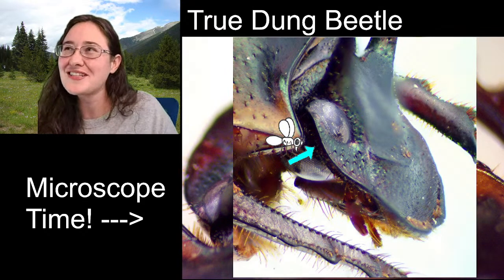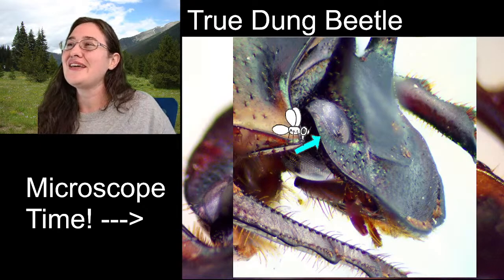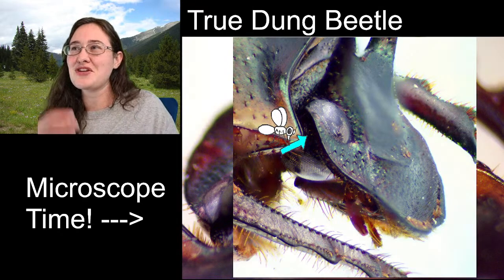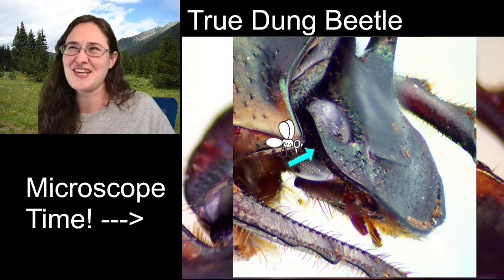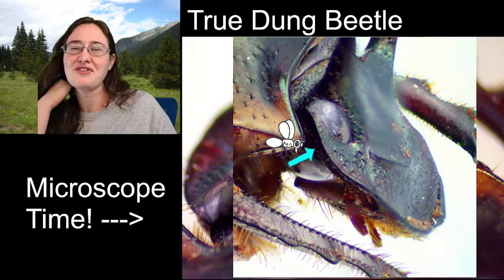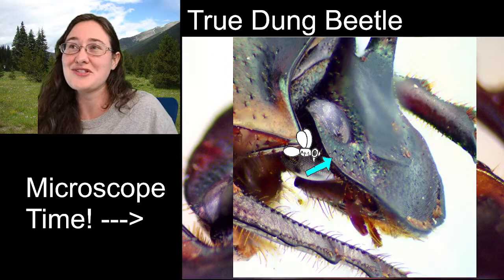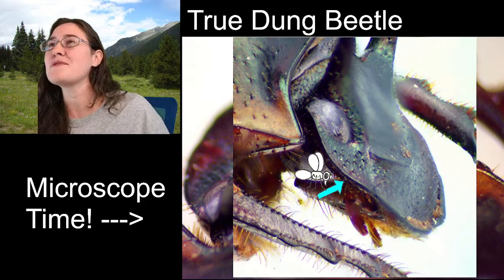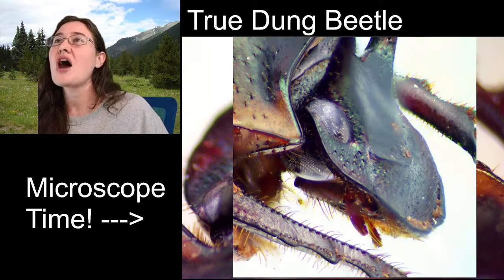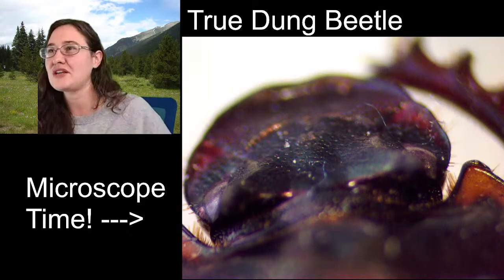And I've always thought that that was kind of funny because I wonder, like, if the brain of this beetle just doesn't take into account those eyes because they never see anything, or if they do have, like, different sensory abilities because they're completely blocked off from the rest of the world. And then here are our horns, but I'm going to have to show you the horns underneath the microscope when we turn it sideways. Then you'll see it a little bit better.